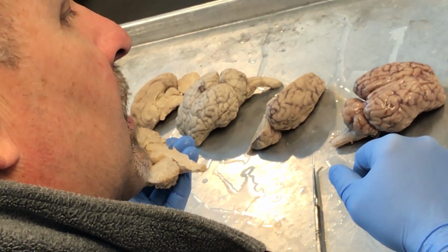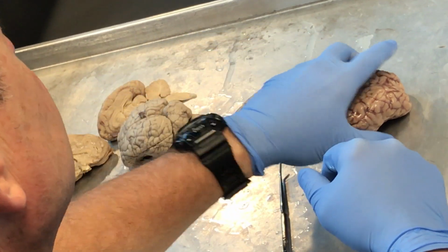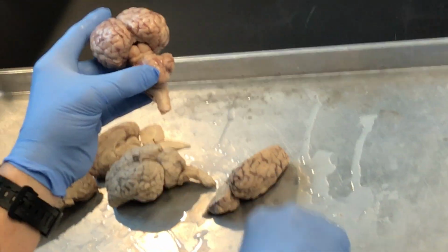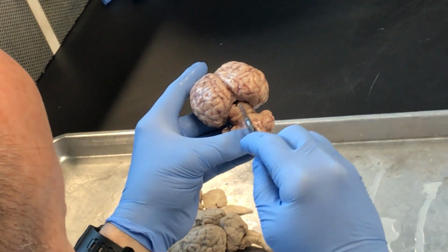Next thing you've got cerebellum. You have corpora quadrigemina. Corpora means body, means many, means multiple bodies, and quadrigemina means four. So if you look here, this is the corpora quadrigemina. See the four bodies there, bump, bump, bump, bump.